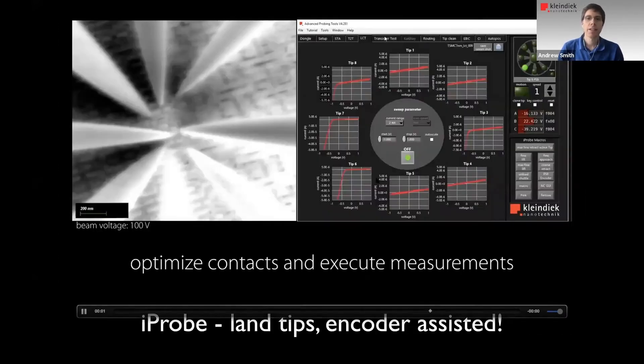And this is followed by optimizing contacts. And the way we do this in the next slide is we scan each tip. We do a permanent IV curve on each tip in a given voltage range. In this case, it was minus one to one volts. And we scan each tip 10 times per second, and this gives a live, real-time feedback. While the actual electron beam is frozen, we get live feedback on each tip's contact situation. And what we can tell from these graphs is that tips one and two, which are these two here, are not in contact with bulk or don't have a connective connection to bulk. Tip three does have a diode connection, as do tips six, seven, and eight. And so we can use this information to adjust the probe's position very precisely, doing very minute steps, without even looking at the image. The beam is still frozen, and we can make sure that we have good solid contacts.